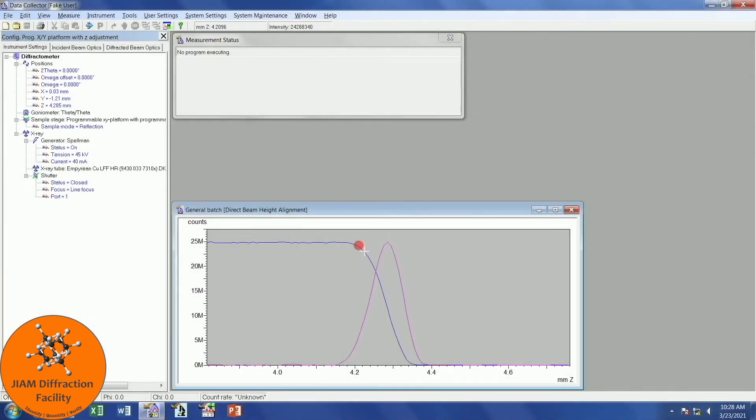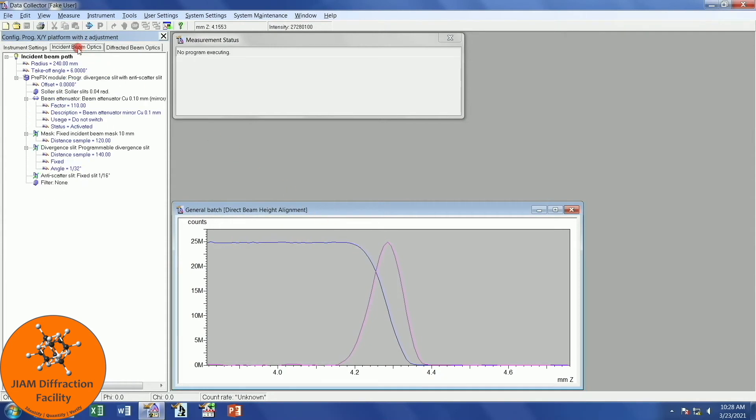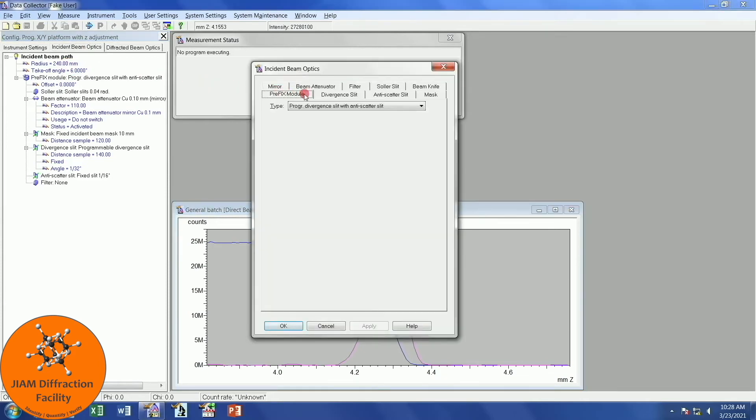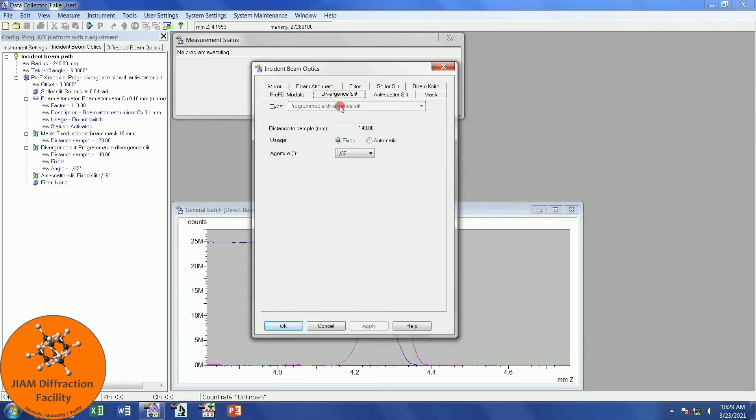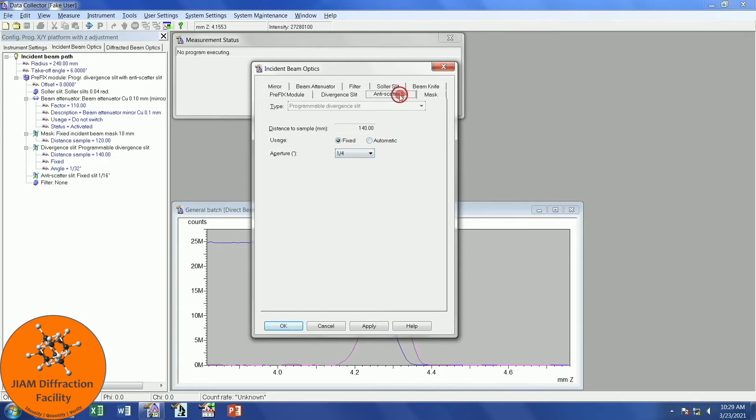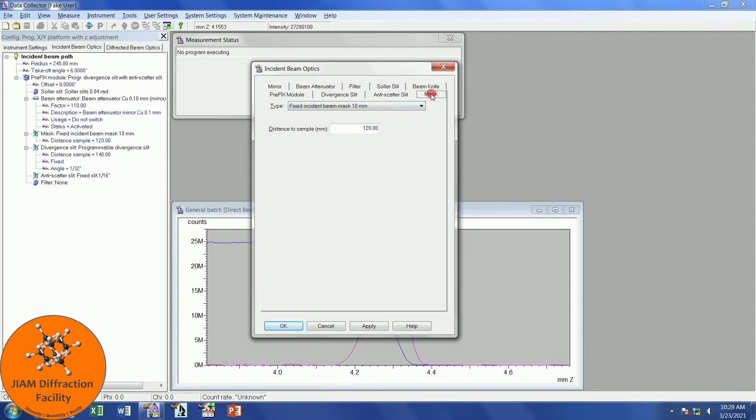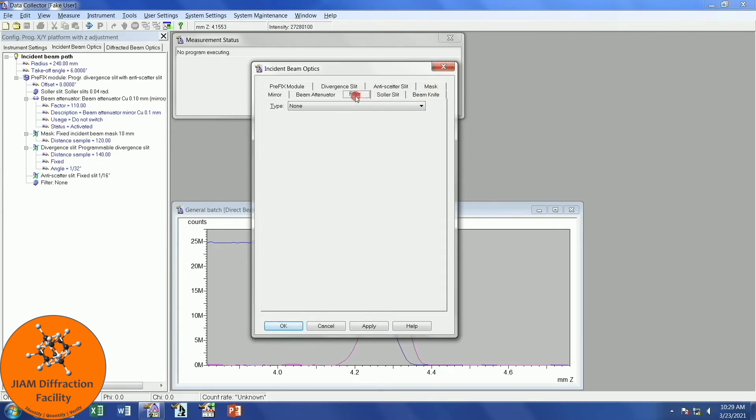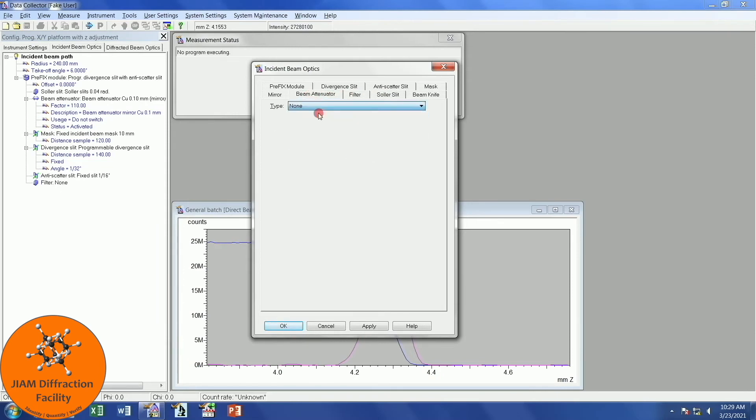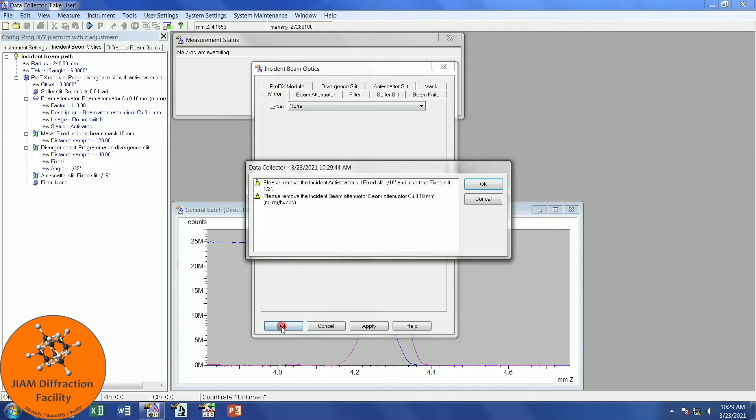Now that the optics have been changed, let's announce the changes in the computer. Incident beam optics, I will double click. I still like to go through every tab, even if I didn't change anything for that tab, just to make sure I don't forget something. For divergent slit, I'm going to use one-fourth of a degree. If you use something different, then change it to whatever you want. My anti-scatter slit is then one-half. Mask, that's still 10 millimeters. I still don't have a beam knife. Solar slit didn't change. Filter didn't change. I removed the beam attenuator, so I need to change this to none. And the mirror didn't change. I will click OK. I did these things, so I will click OK.